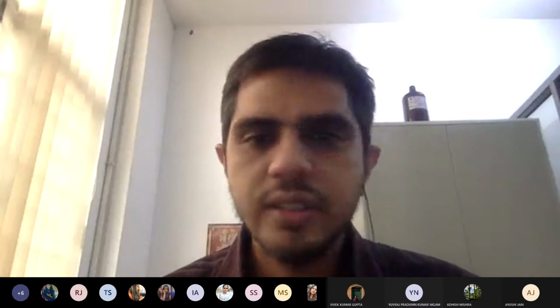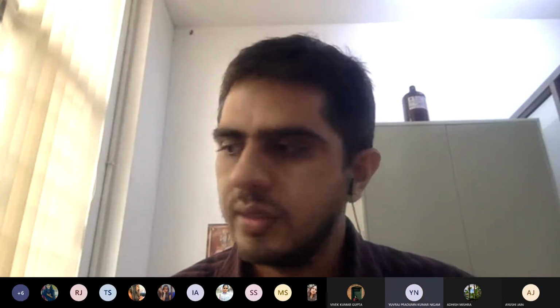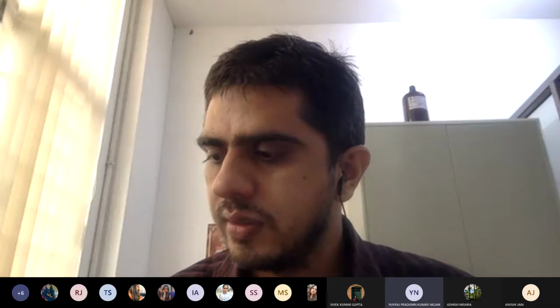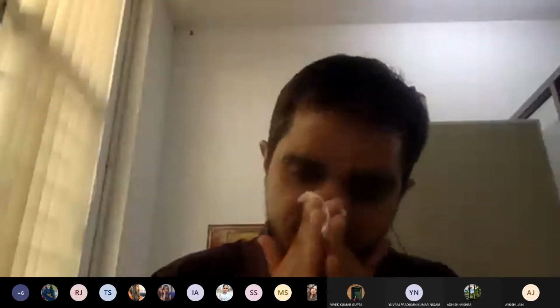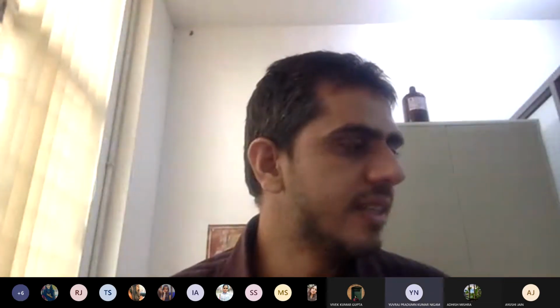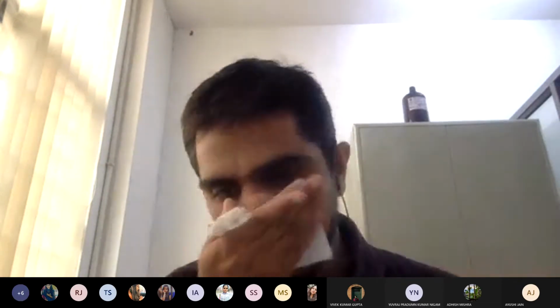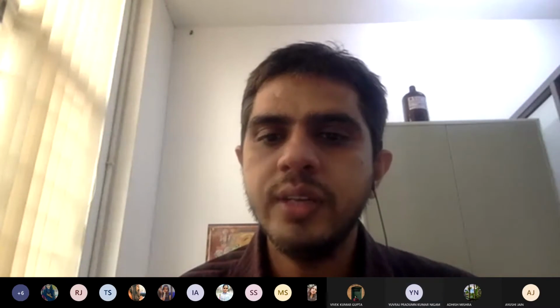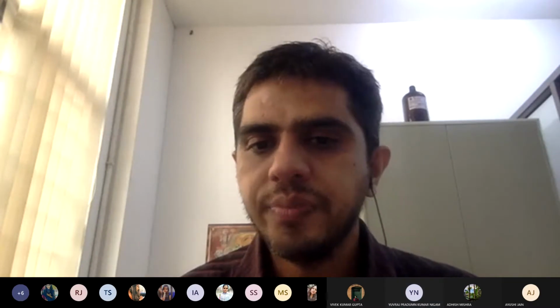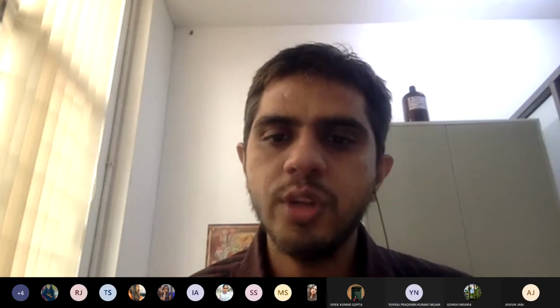Okay, sir. So yes, Yuvraj. Sir, is there any range of values which determines the purification of DNA? As I mentioned, 1.8 is the one which is considered pure DNA. So you can say 1.8 to 2.2 you can consider good DNA. If it fluctuates above 2.2, there will be RNA impurity. Below 1.8 is going to be protein impurity.